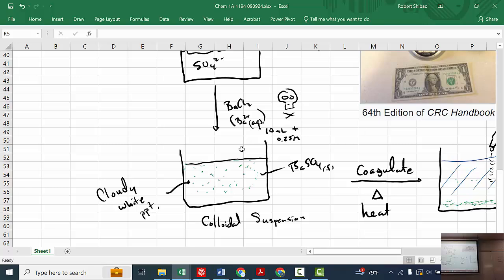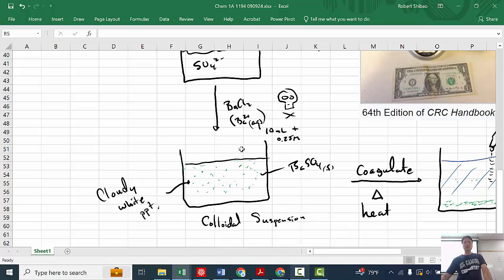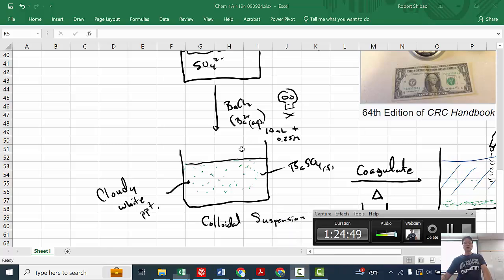All right. Well, I guess that's it then. Just go ahead and get started. You'll have to go to the stock room here to get your sample. You'll need a pair of beaker tongs from that wood box over there. Just one beaker tong per group is probably enough, or two. And let me see if I can get the stock room.